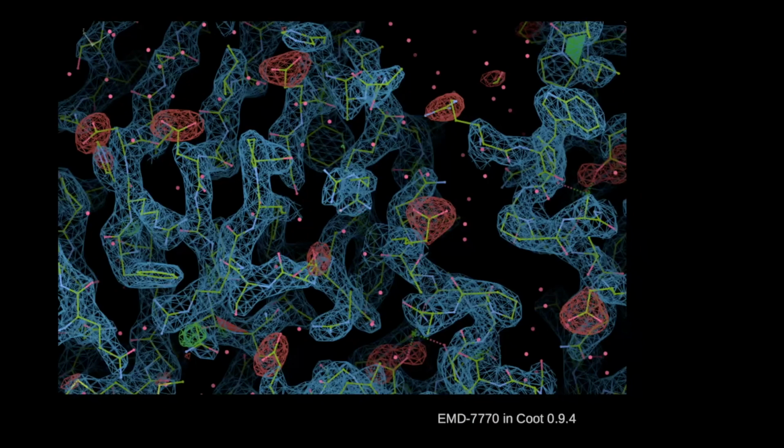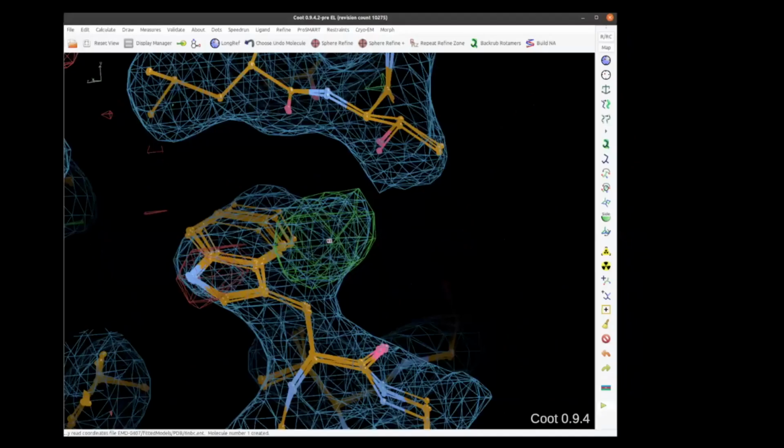And another difference map from a cryo-EM, I've forgotten which reconstruction this was. Oh, there it is, 0407, sorry. You can see they used, I think, molecular dynamics to generate these models here, but no matter how much you wiggle around your side chain, well, this particular side chain at least, it's not going to flip around into the probably preferred rotamer there. But merely peak searching the difference map, as you would do for an X-ray structure, brings this to your attention very readily. And the fix is straightforward.